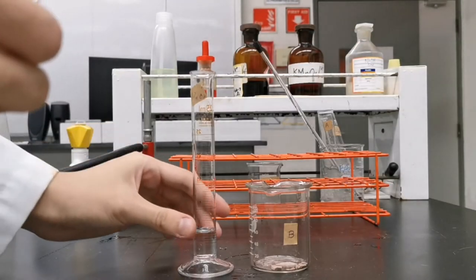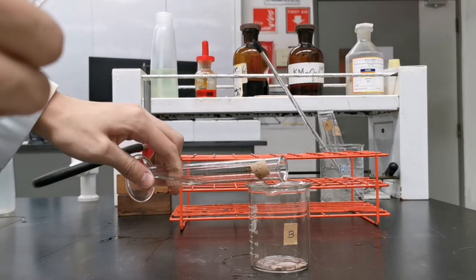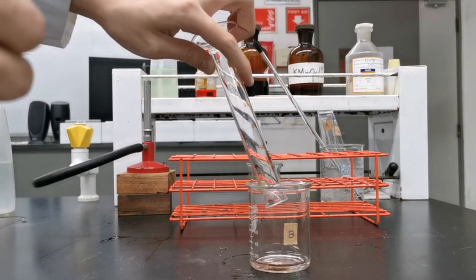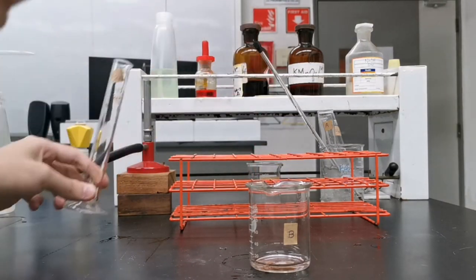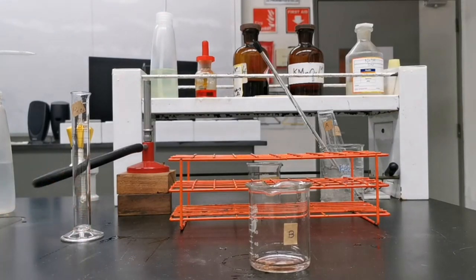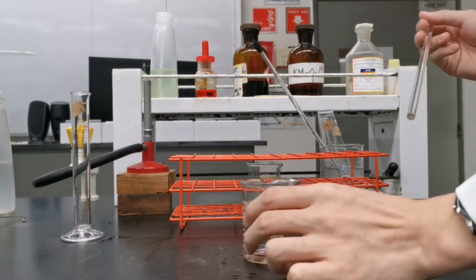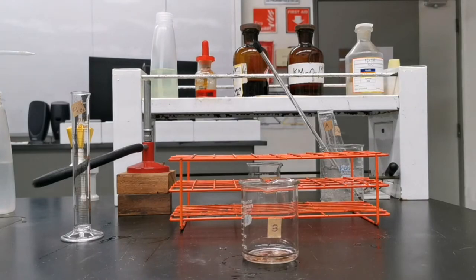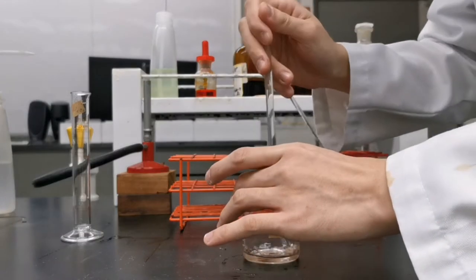Waiting for both boiling tubes to cool down, I proceed in preparing my naphthol. To do this I add 5 mls of dilute sodium hydroxide into the beaker containing the naphthol and stir to dissolve all of it.